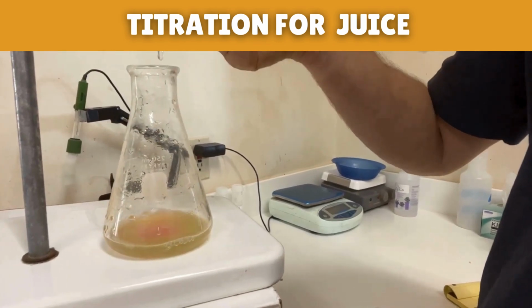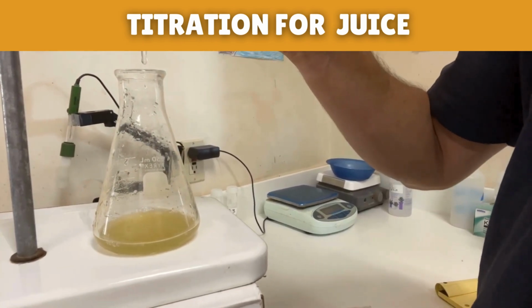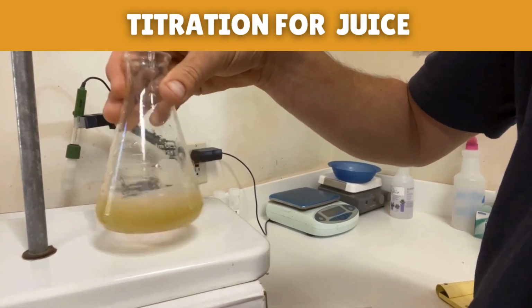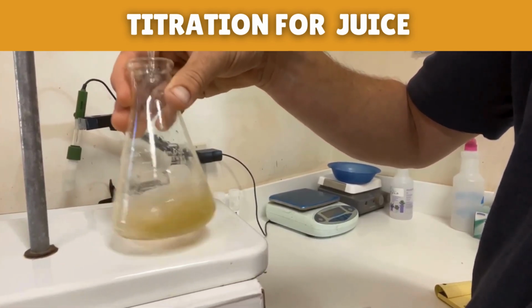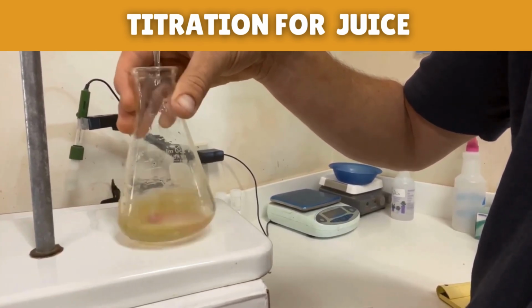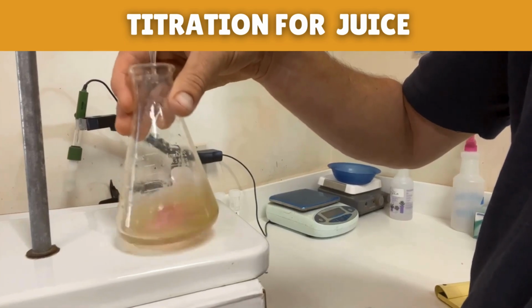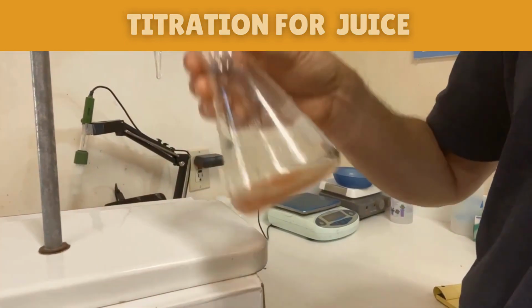Right now you can see if I turn off this, the pink goes away, that's base consumed. So we're going to continue this, maybe go a little bit slower, until this all turns and remains pink. The pink persists longer and longer as we get closer. Okay, the color's persisting.